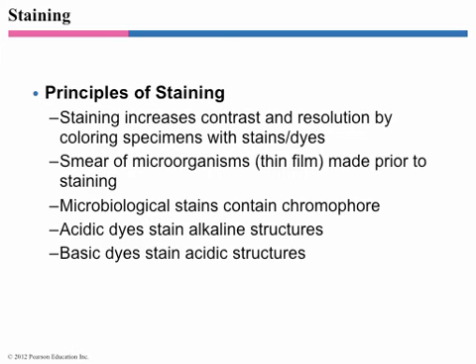And generally speaking, things which are basic are positively charged. Things that are acidic are negatively charged. And what's your membrane made out of? Phospholipids. Who remembers the charge on a phospholipid? Or on a phosphate? Negative.